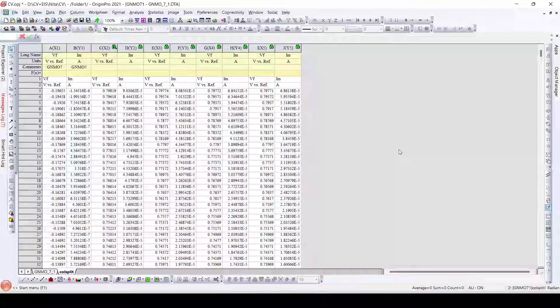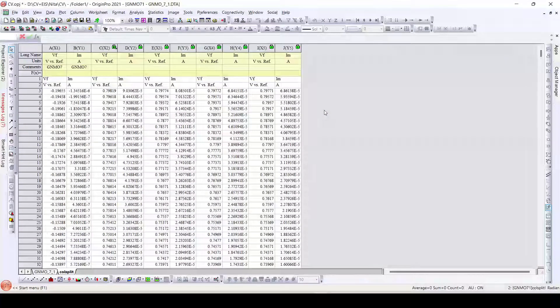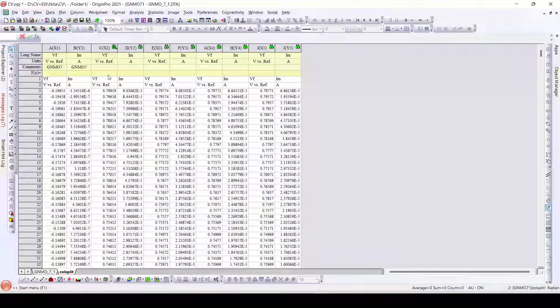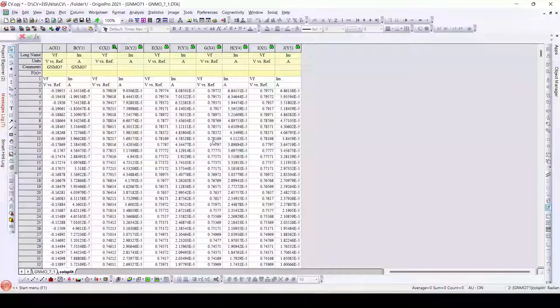Hello friends. As we can see, this is cyclic voltagram data and in our previous video we have learned to split that particular data according to the cycles. Here we have 5 cycles and we have divided or split the columns into 5 datasets or 5 cycles. We have learned this in our previous video.